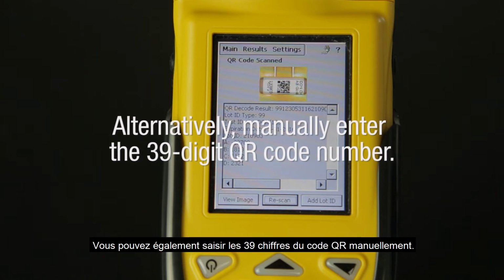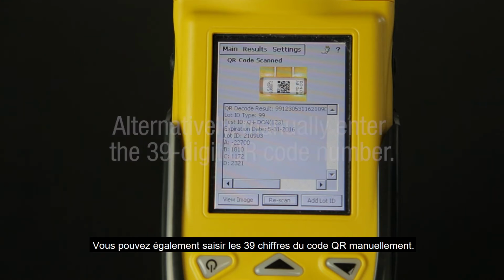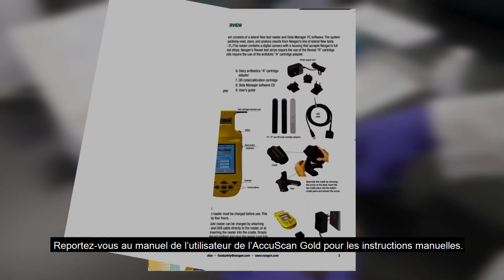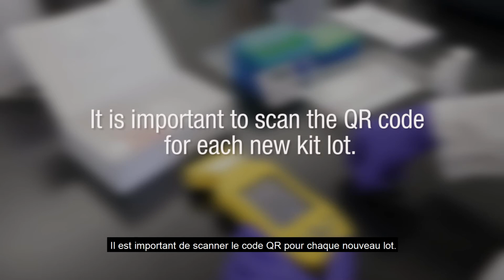Alternatively, you can manually enter the QR's 39-digit code. For instructions on how to do this, see the AccuScan GOLD user manual. It is important to scan the QR code for each new kit lot.